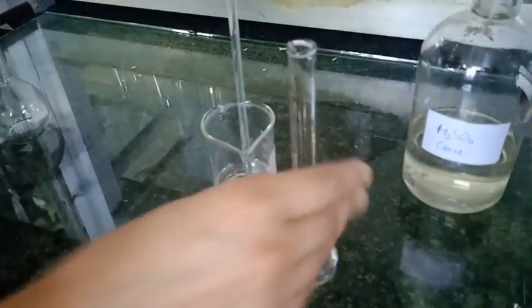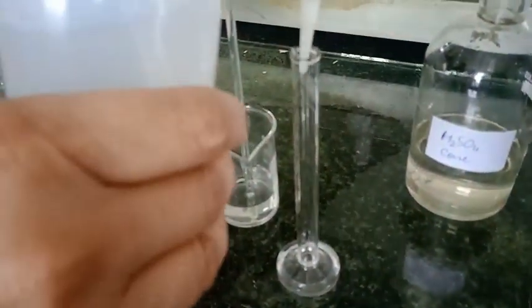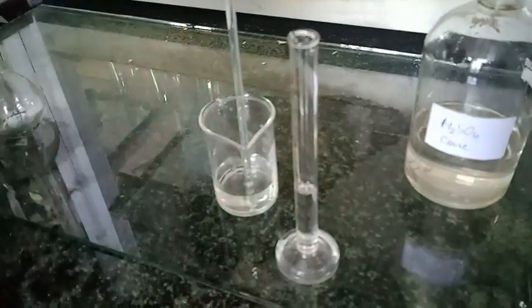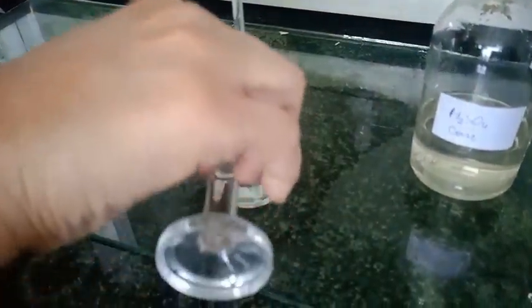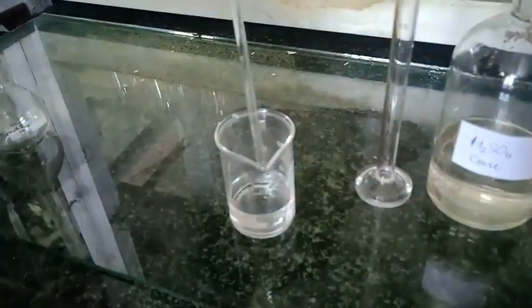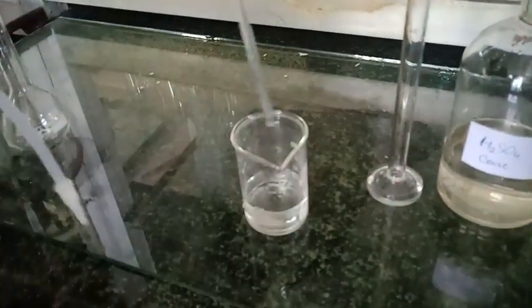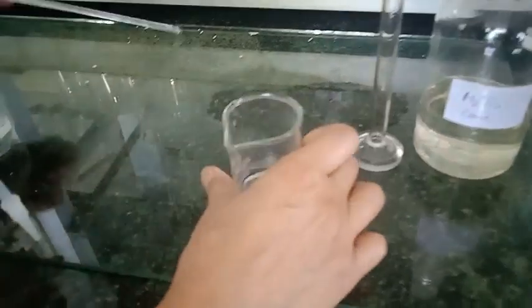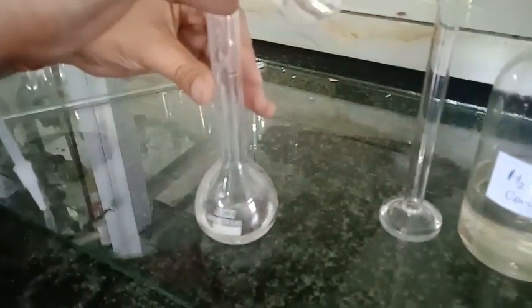Now I am going to rinse this measuring cylinder two to three times and add this rinsed water to the beaker. I am also going to wash this rod, and then transfer this water and sulfuric acid solution to the measuring flask to make it up to 100 ml.